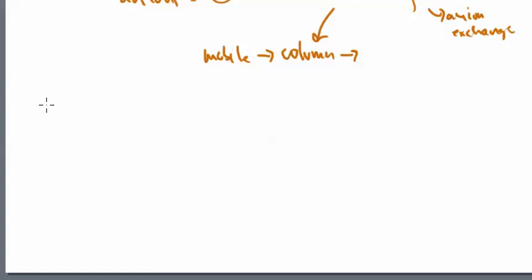So let's say that this is the wall of the column, and off of this I get some stationary phase. Now this stationary phase could be silica, it could be alumina, it could be some kind of carbon chain with benzene rings on it. I mean, it could be a doozy. So I'm just going to represent it with dots. And off of this stationary phase, we can modify the groups that are existing there. And this is what determines the difference between a cation column and an anion column.